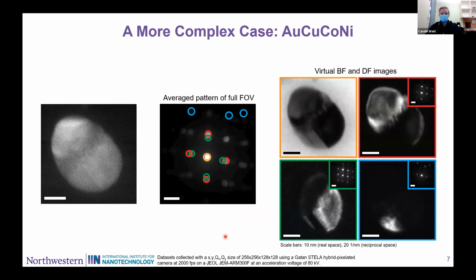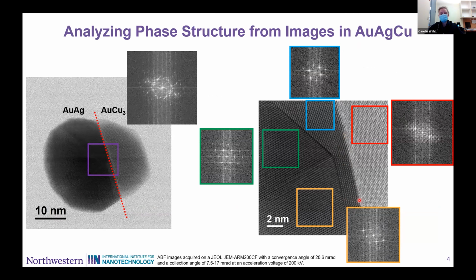There are limits to how accurate this is. Perhaps the biggest issue is that the nature of the interface is not necessarily entirely clear. If you have a whole lot of elements in there, that interface is not going to be sharp. It's going to be washing out. You can kind of see it here, right? There's a broader region of an interface versus this really, really sharp version over here. And so that's going to make it hard to distinguish what's what.